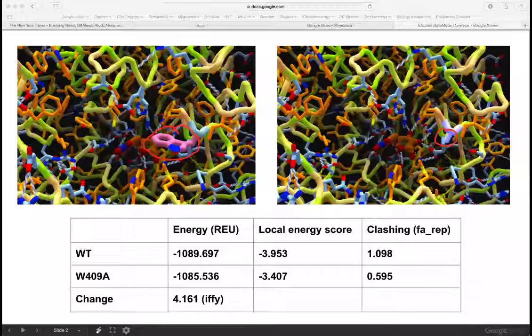Okay, so just to review some of the Lab 4 material. Once we make that substitution, we want to look at the change in energy state of the whole protein. And I've done that. And then I've gone through the optimization, the wiggle and shake. Okay, and we can see this was the original energy score. That REU is Rosetta energy units, or you can think of it as relative energy units. And you can see that it's gone up a little bit with the alanine substitution.